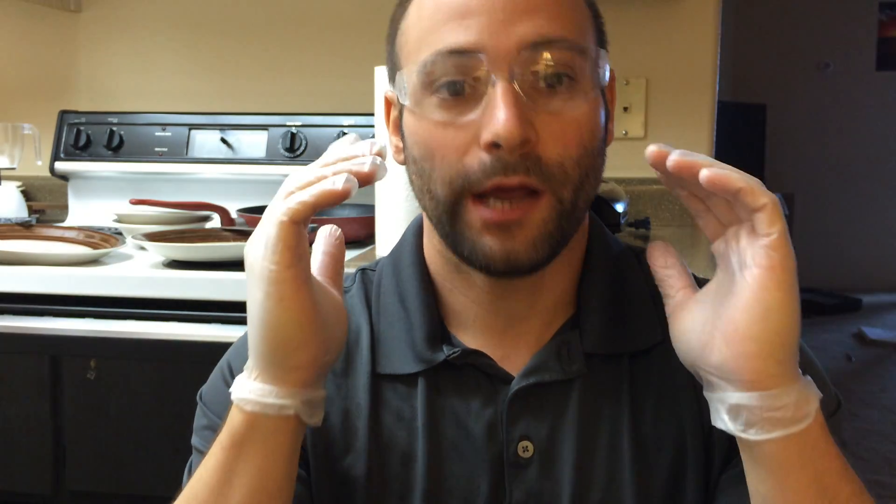Notice that I am wearing PPE — personal protective equipment — and you always have to wear PPE. Something I learned in school. I could actually do what I want here, but I thought it'd be funny to put PPE on anyway. Got my safety glasses and protective gloves. Alright, let's get to the experiment.